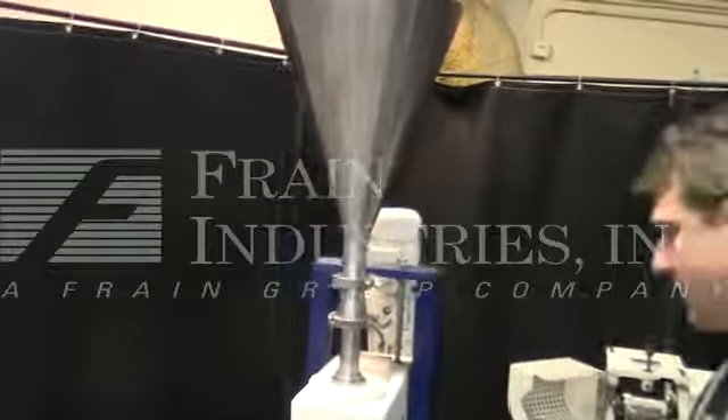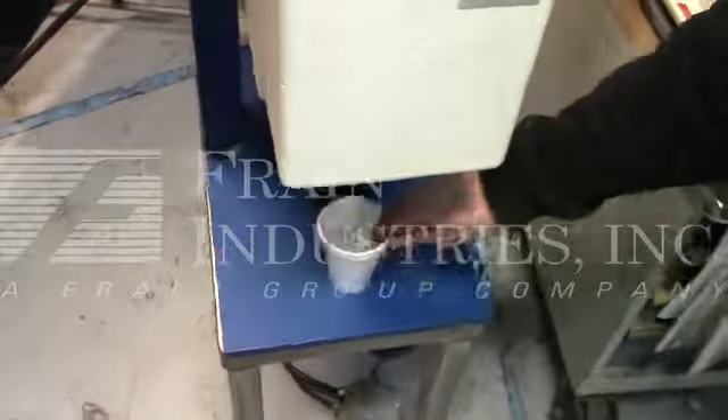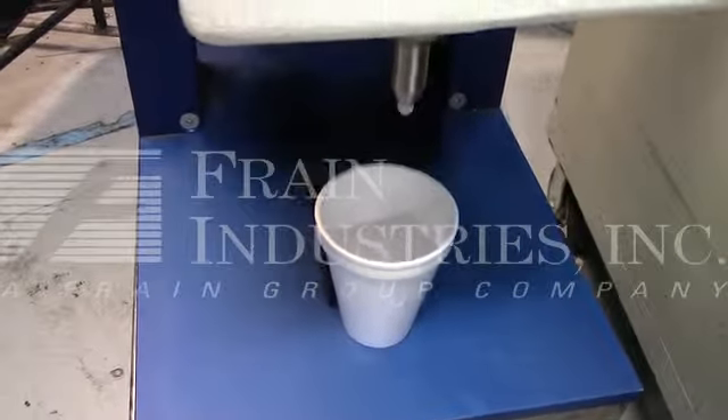We've set the tube filler up so it fills a product weight of 22 grams. It's operated by the foot pedal switch at the bottom.